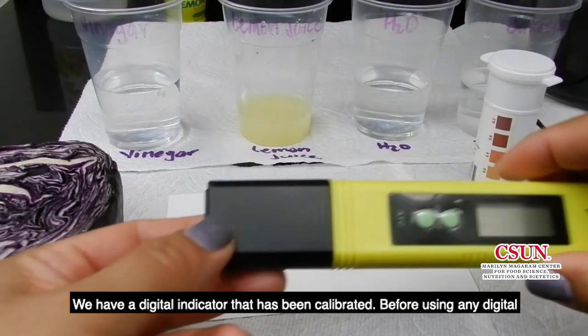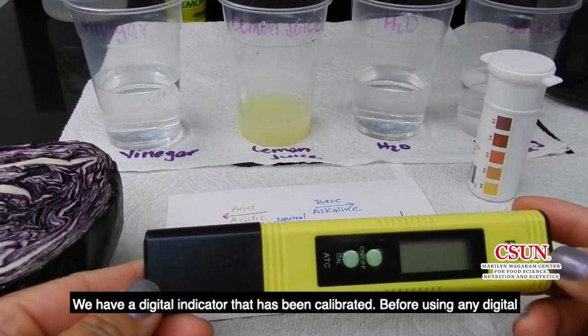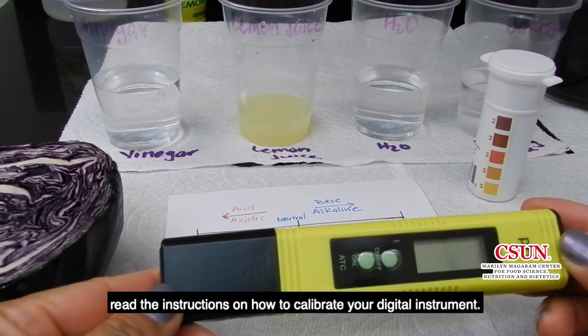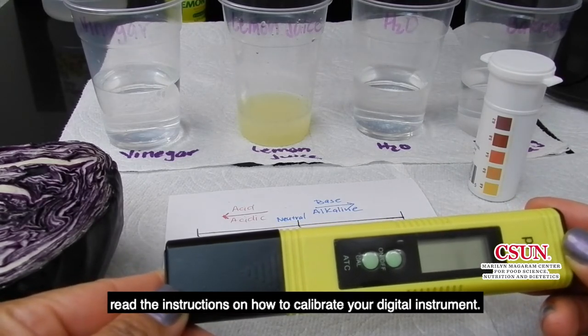We have a digital indicator that has been calibrated. Before using any digital instrument, read the instructions on how to calibrate it.